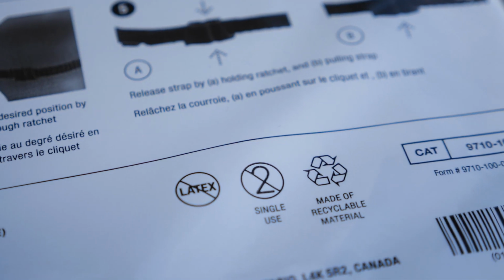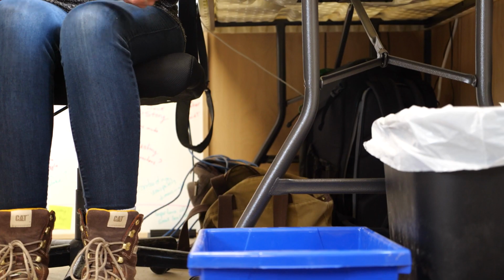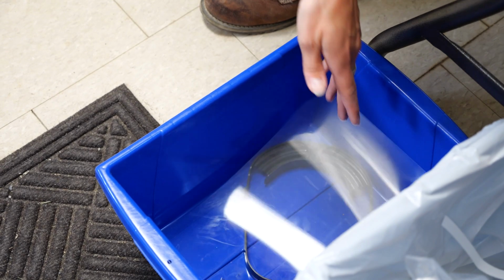Both the visor and the headband have been designed to be fully recyclable but should be separated before doing so. For facilities with designated shield recycling systems, place the visor and the headband in their designated containers.